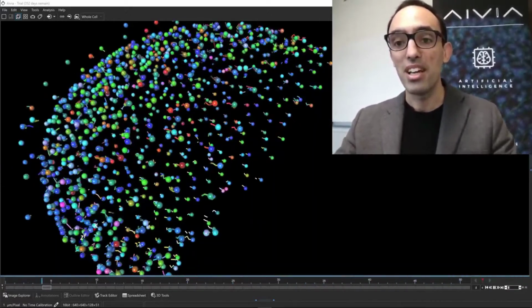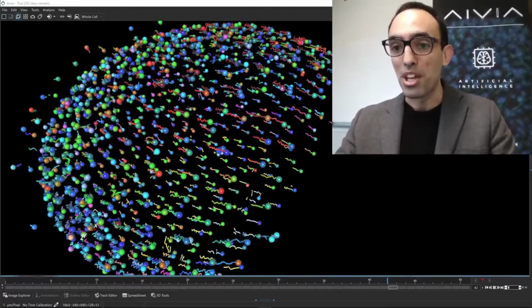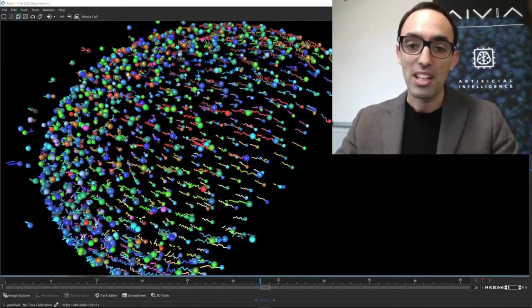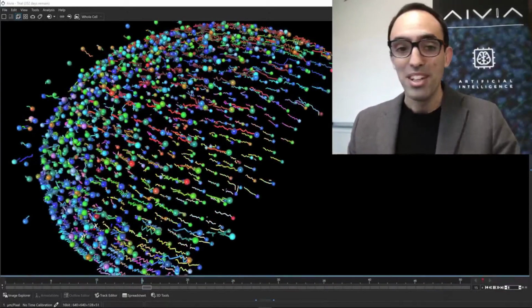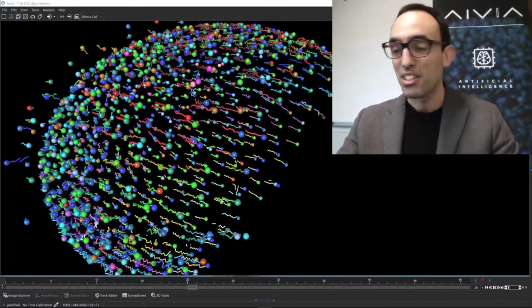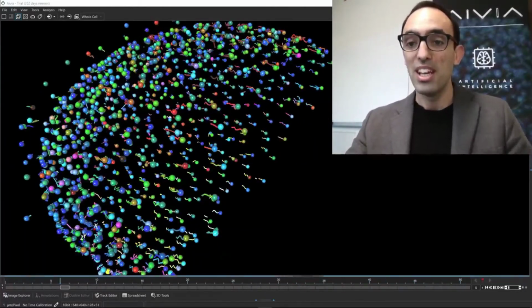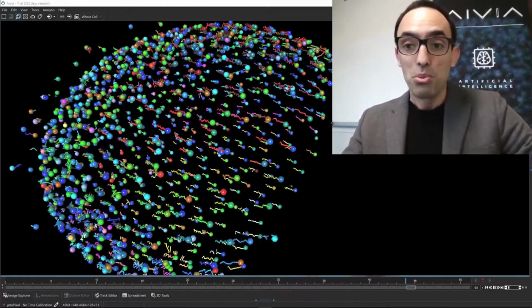So we're here today to launch Aivia 7. My name is Luciano Lucas. I'm the EVP, the Vice President at DRVISION, and we are today at Wake Forest Downtown in North Carolina. And we are here with Glen and Heather. They are the facility directors here at Wake Forest Microscopy Facility. And we will be discussing what's new with Aivia 7.